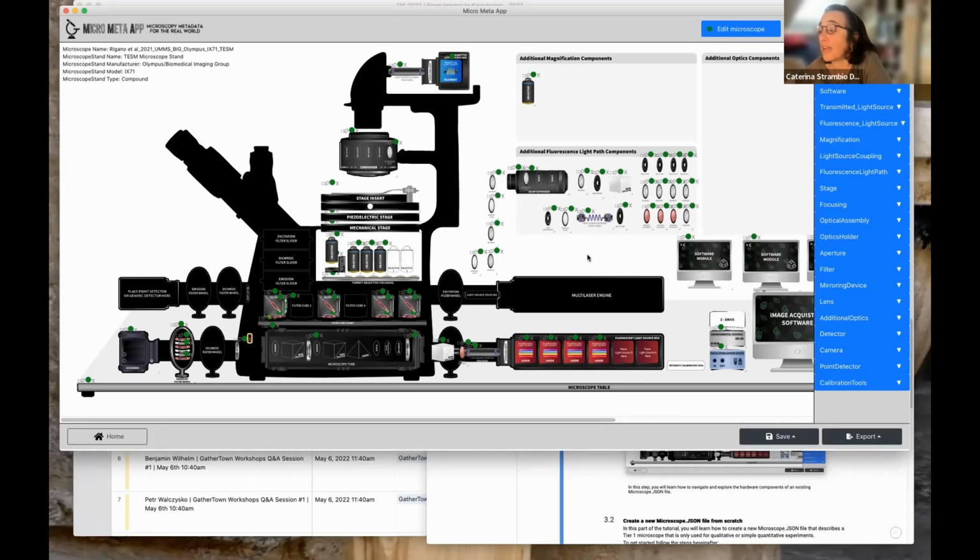But if you want to start a documentation completely from scratch, then I'll show you how to start from scratch in the next step. If there are any questions up to now, please let me know.